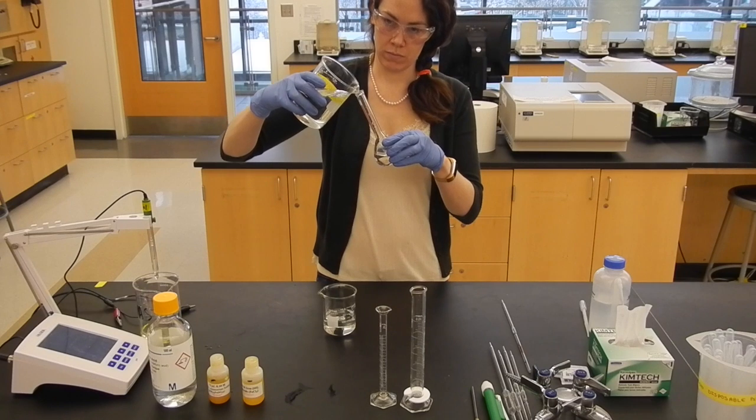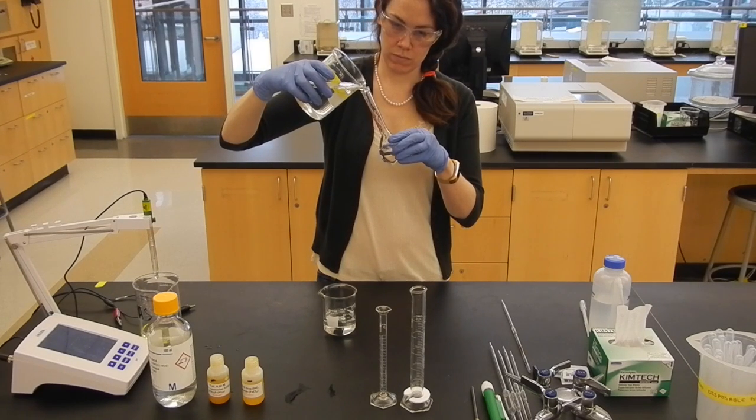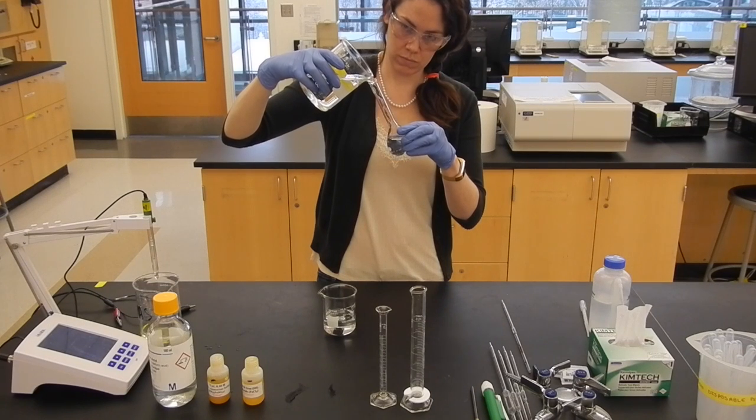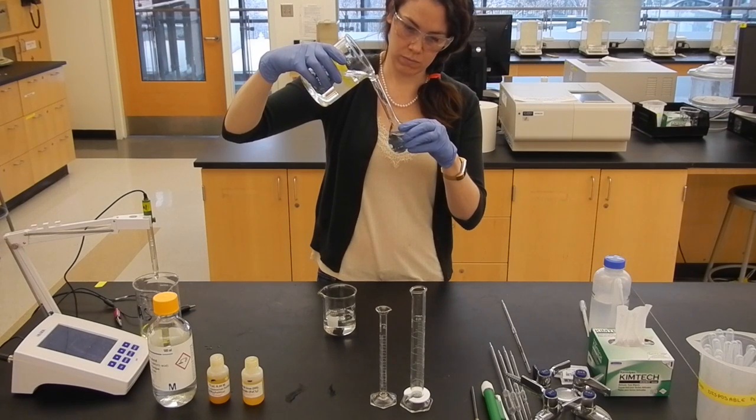Slowly fill the volumetric flask just to the line with water, again being careful not to overfill.